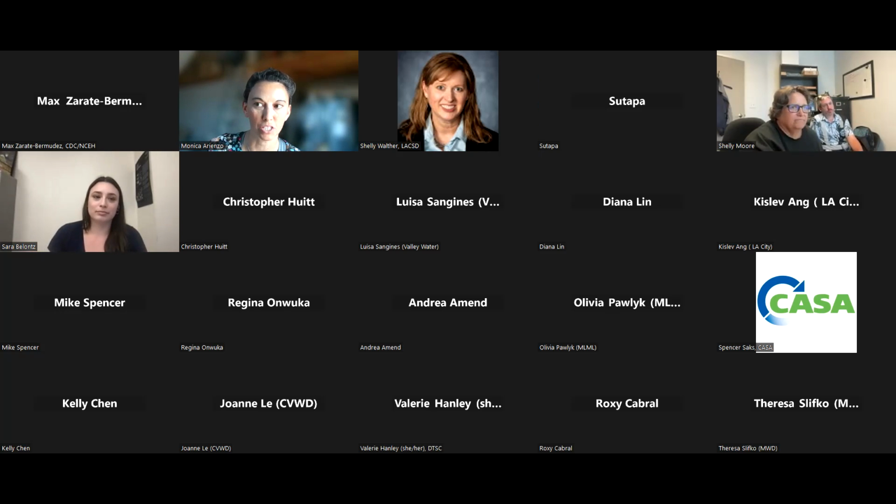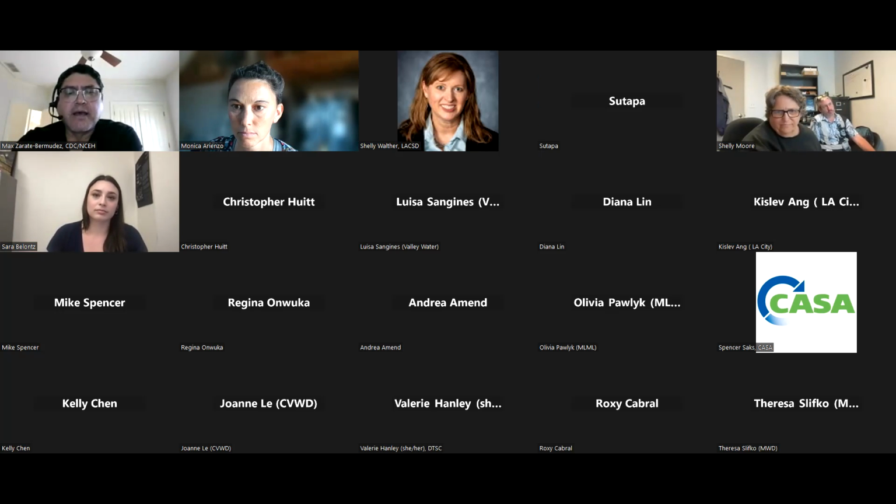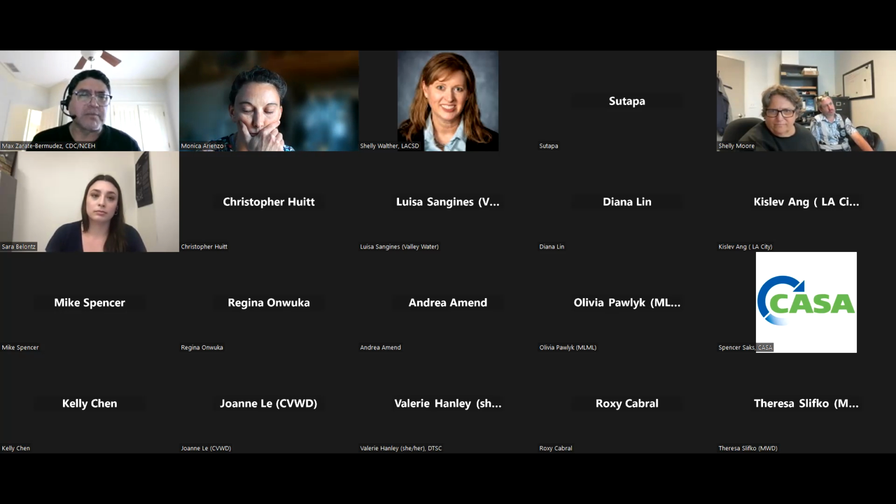I think we have time for one more quick question, Max. Thank you, Sarah. Max Zarate from the CDC. I think your presentation is also showing us the need for new methods to characterize micro and nanoplastics physically and chemically. If not mistaken, AFM-IR has that quality. You said that you can determine the 3 dimensions of particles plus identification of the chemicals. And I think your total mass was calculated using that tool, but you presented the total mass instead of splitting PDMS and polystyrene. So what do you think are the applications of these two techniques with regards to the different types of matrices that we have in water?